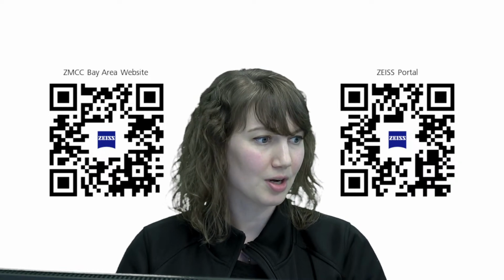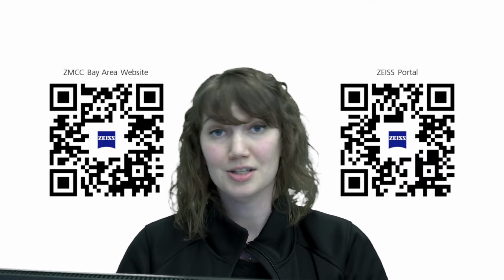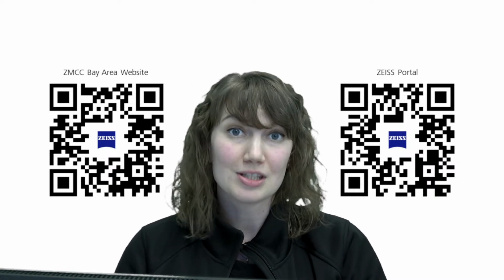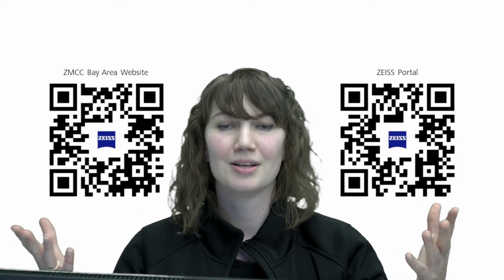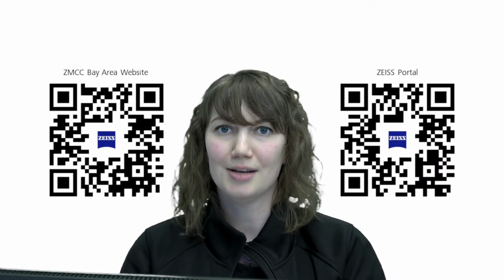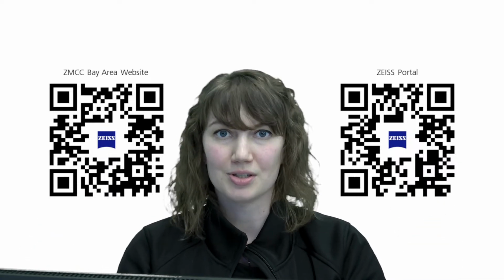Thanks for the questions. I'll see if we have any more coming in. But yeah, it's really exciting stuff. We've had some really cool demos come through this summer and spring. And again, if you are curious if it will work with your samples, if you have a very niche application and want to see if this will actually work for it, contact us and we'll get you all set up. I like receiving cool samples here and running them on the instruments for you. If you haven't had a virtual demo before, it's a format like this, and you get a front row seat on the microscope with your samples on the system.